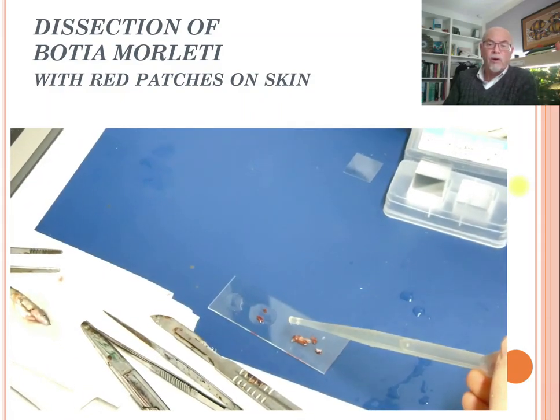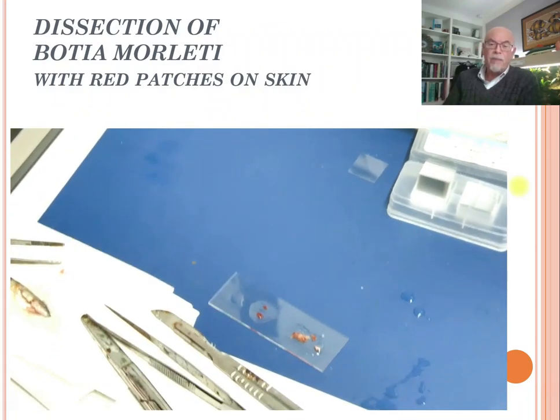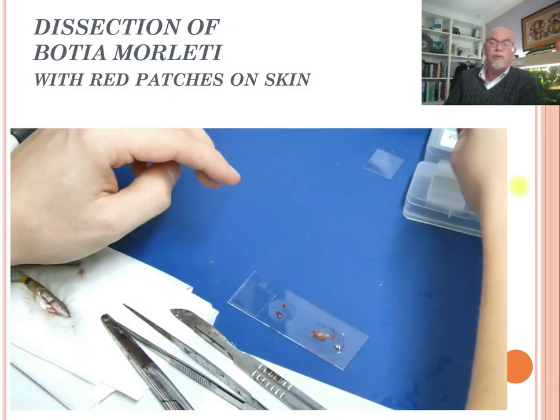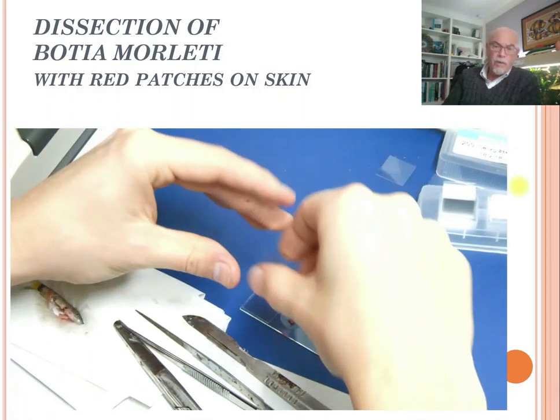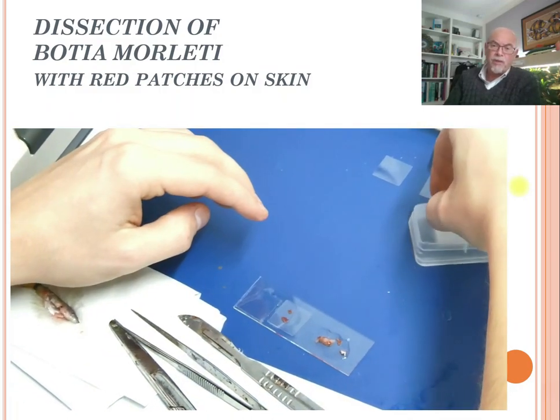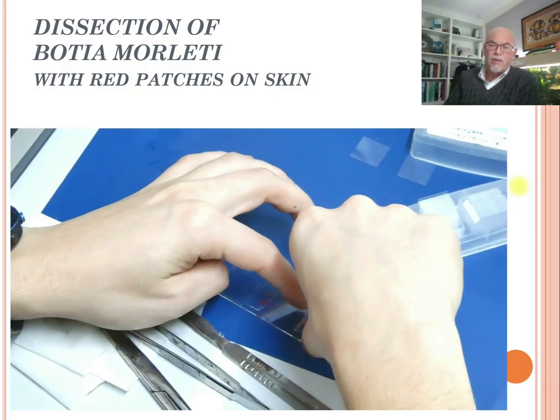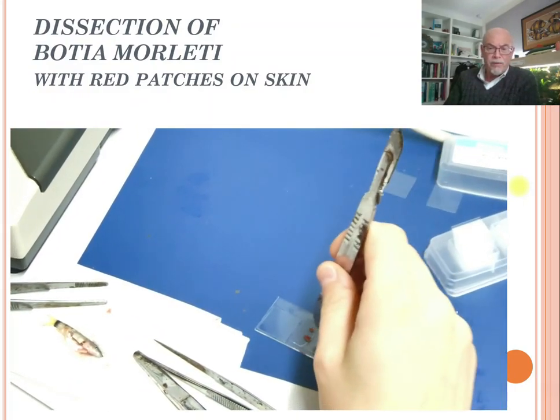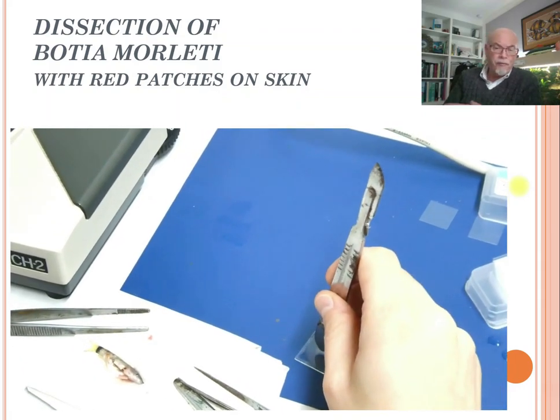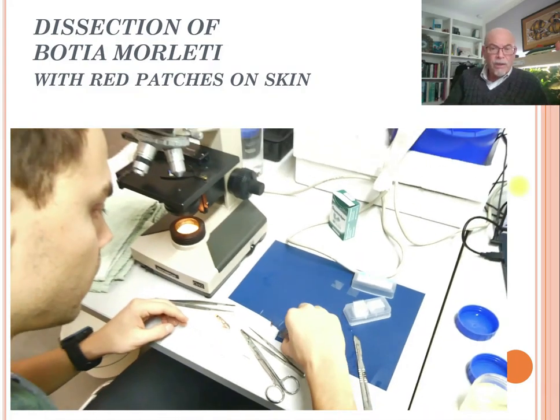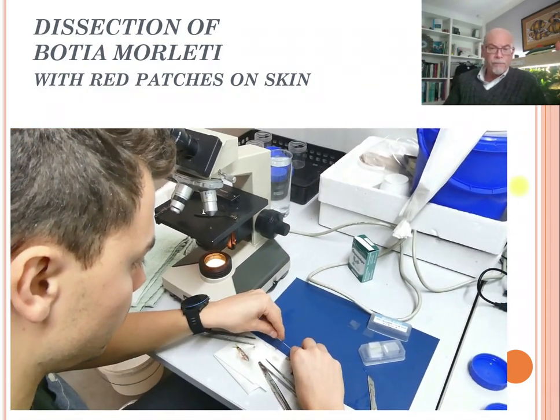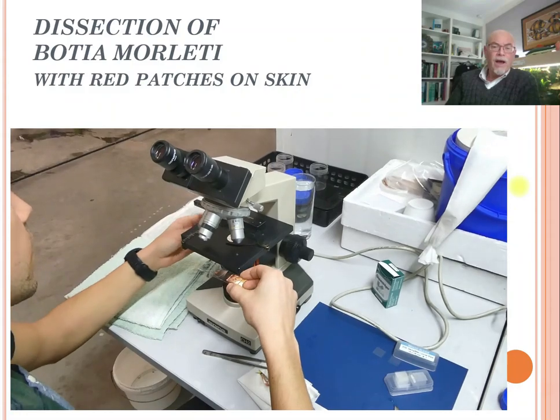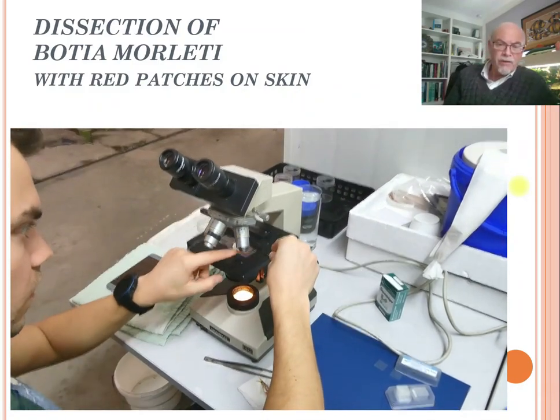Now he's adding some drops of water — we use the aquarium water because it has the same conditions that the pathogens are used to living in. Now he's putting on small cover slips on the different organs, as we prefer small cover slips because it's easier to examine the organs separately, though here he put them all on one slide. It took him about three minutes. He's squeezing it a little bit so the organs and tissues are flattened, making them much easier to observe under the microscope.